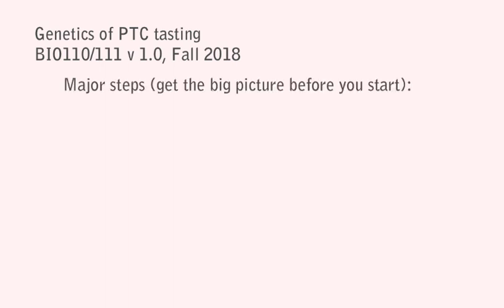What I'm going to do with this video is to walk you through the whole lab to give you the big picture. Understanding what you're doing and why makes a huge difference for the success of this lab, both in terms of the results we get and as a learning activity. Now, the written part of this lab explains things really well, and you should read through the procedure carefully and twice at least before you come to class. All this preparation will actually save you time later when you find that you can carry out the steps with confidence rather than having to reread at the last minute because you're not sure if you're doing something wrong.